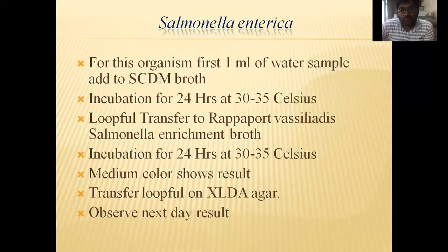Then you have to take a loopful and transfer it onto the XLDA, xylose lysine deoxycholate agar, for the confirmation of the Salmonella. Next day, you have to observe the result on the XLDA, with black colored colonies with the smell of H2S. That indicates a growth of the Salmonella enterica.